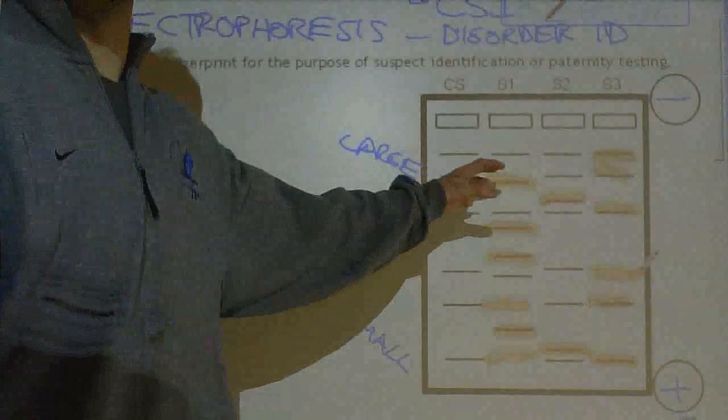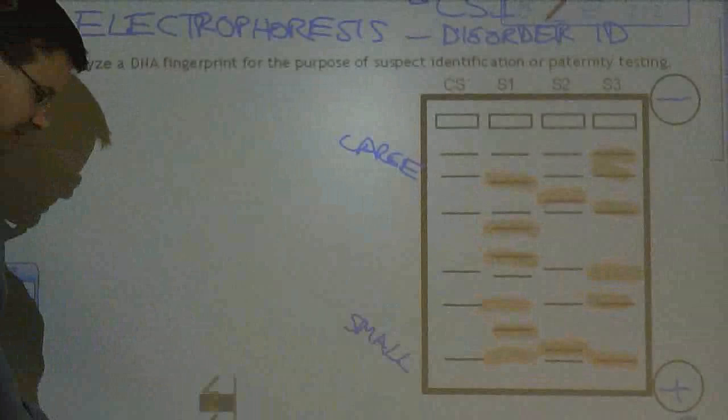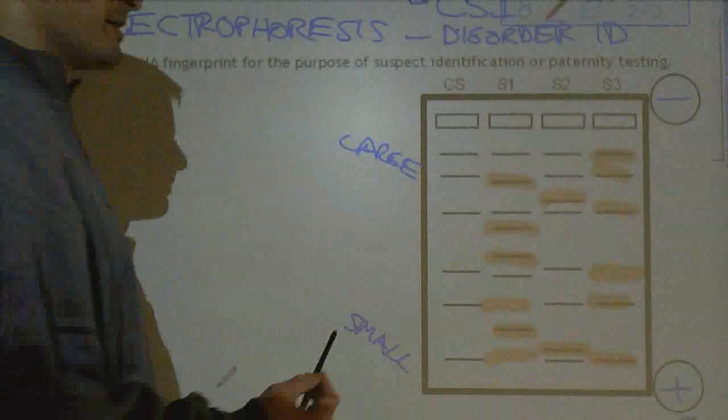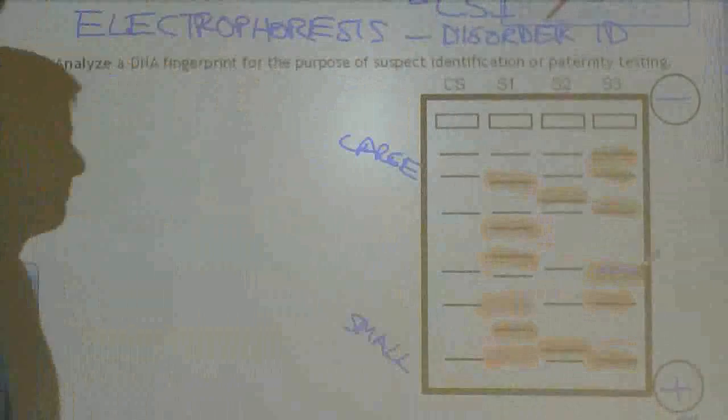So in this example, all of our suspects are not guilty. Police have to go find some more people to try to accuse for this, but what I'm going to do is fill in the band that would show how this person, if they were the guilty party, would look.